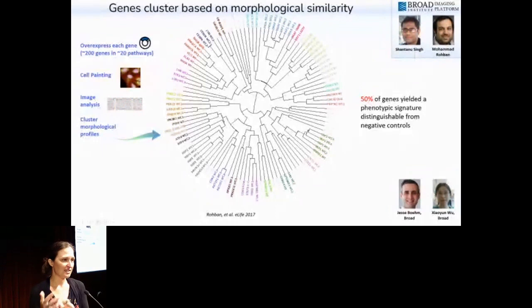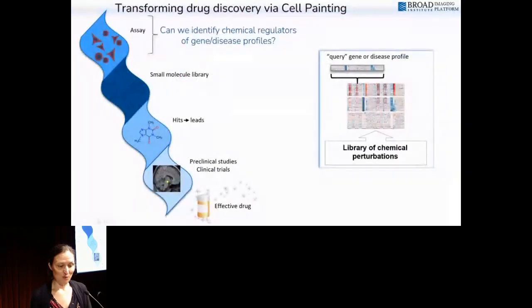We saw mutations in proteins. If it was a constitutively active one, it looked similar to the wild type, but definitely different enough to be nearby, and so on. So really exciting to see this, and made us want to scale up to the whole genome, which just this year we've made data from 13,000 genes, which will be released in November, and I'll describe that more in a bit. So that's pretty exciting. What can we do with it? Well, first of all, we can look at alleles.